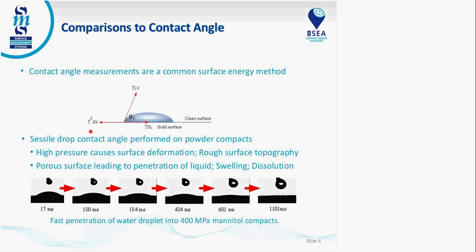More people are maybe more familiar with contact angle. Contact angle is a liquid-based technique where you put a droplet of a liquid onto a surface and measure the contact angle, which is related to the surface energy. Contact angle works quite well for flat, homogeneous films, but once you start using powders or fibers or granules, it becomes much more difficult to get accurate and reliable results. There are other processes like the Wilhelmy technique and powder compaction, but they're not ideal.